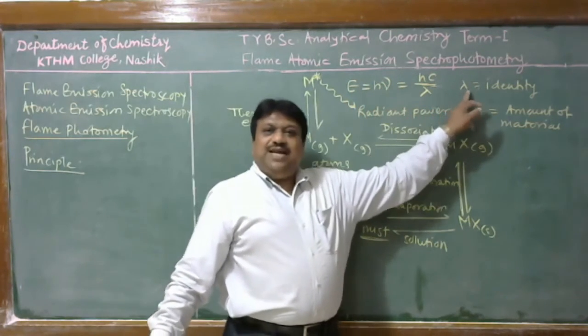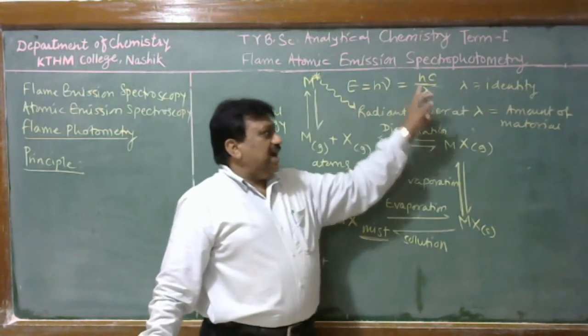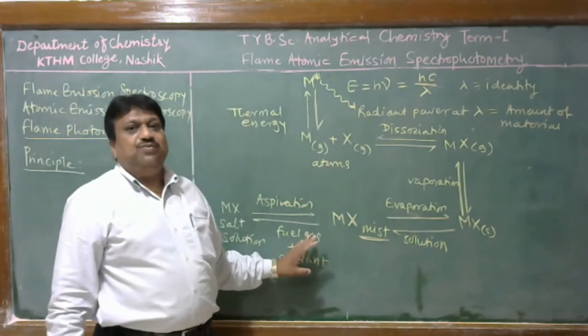The wavelength of that radiation is the identity of the material, and radiant power at that wavelength is related with the amount of material. In this way, flame emission spectroscopy works.